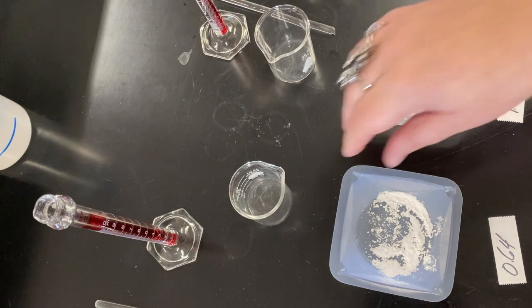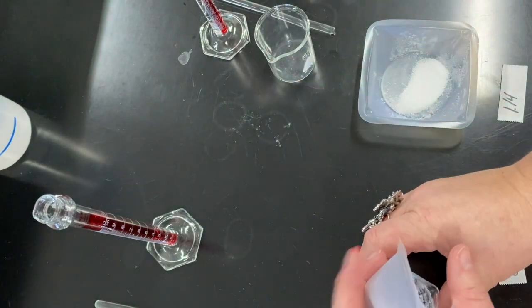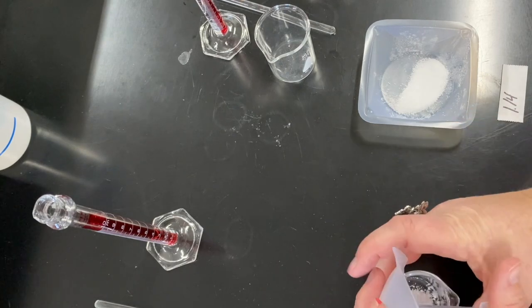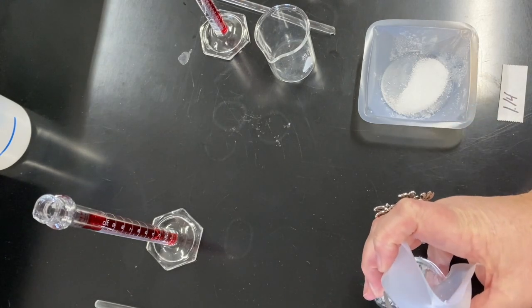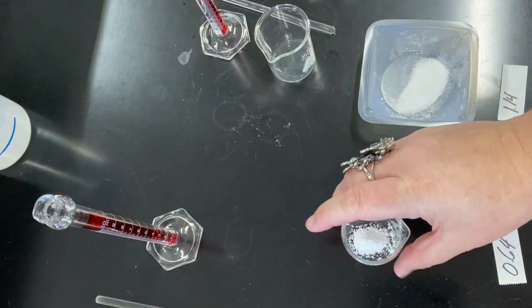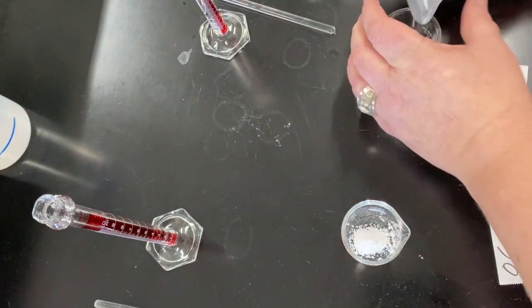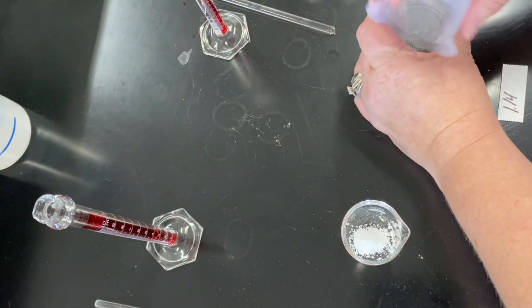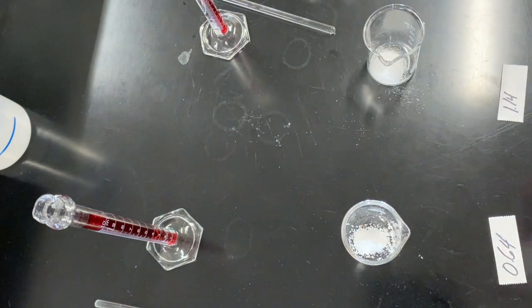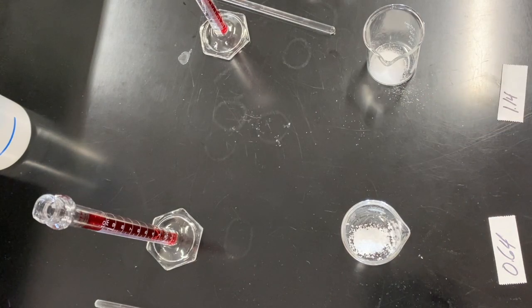So I'm going to add each of these to their own beaker. Try and get as much of that solid in there as possible. We don't want to lose anything. Transfer as much of that solid as we can. Don't want to lose anything. You can see that we've already lost a little bit. That will go to percent error.